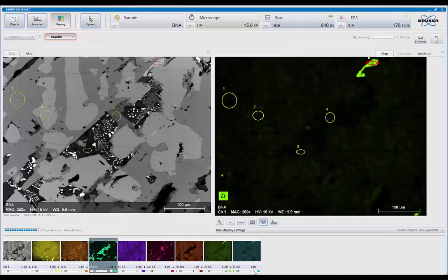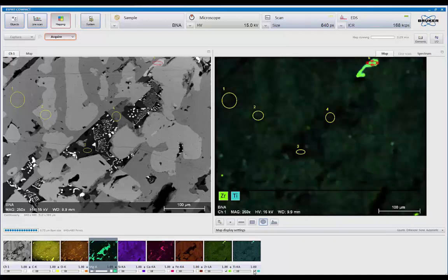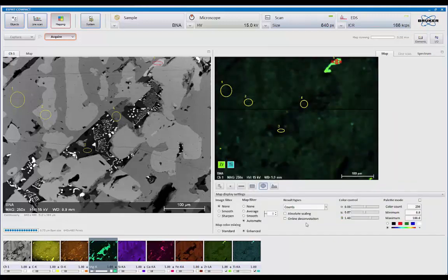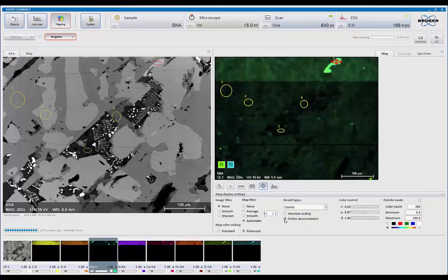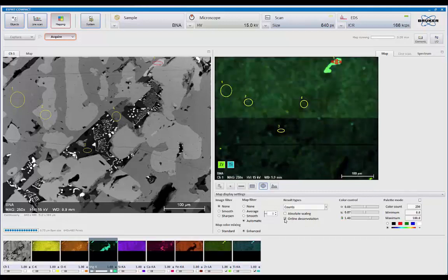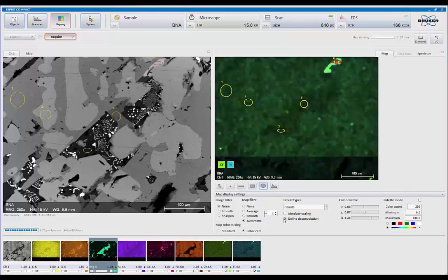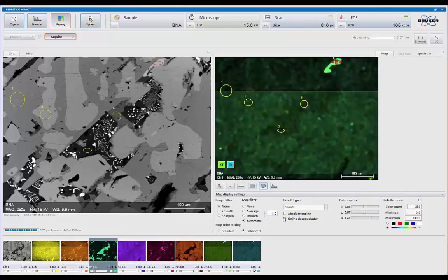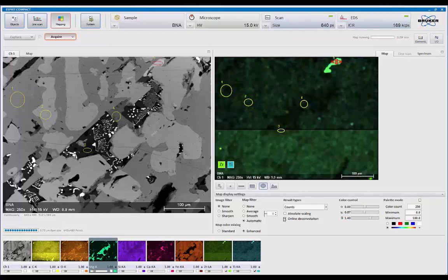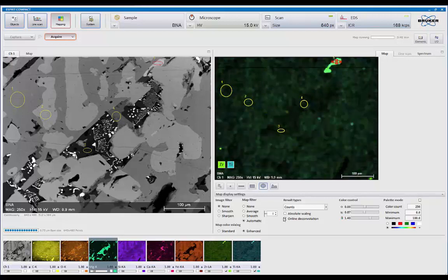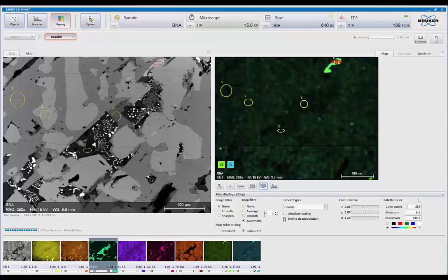So that's where zirconium is present. Also, it overlays with titanium. And turning on the background subtraction, it'll take a pass or two and start suppressing the background for me as well and any overlaps that may exist. So they're not overlapped. They are in the same area. They're not in two discrete different regions.